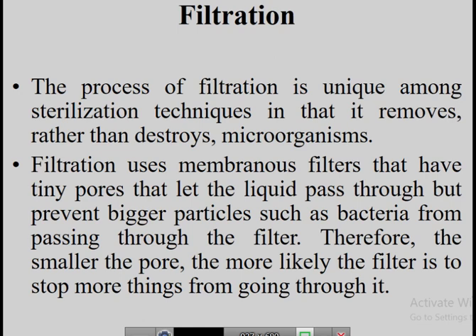Another method of sterilization. Till now we have discussed methods of heat sterilization. Another method is filtration sterilization. This is not a method of heat sterilization, because not all substances can be exposed to high temperature, not even 50 or 60 or 100 degrees Celsius.